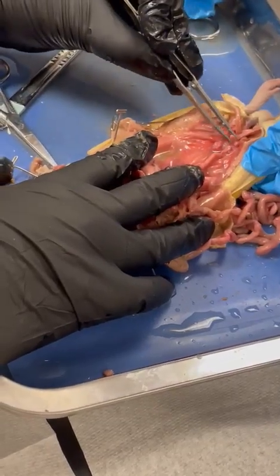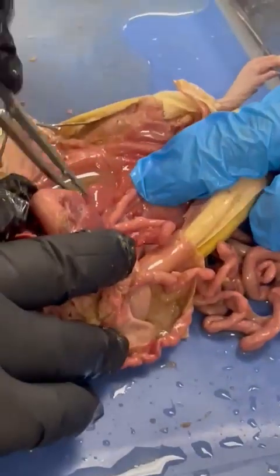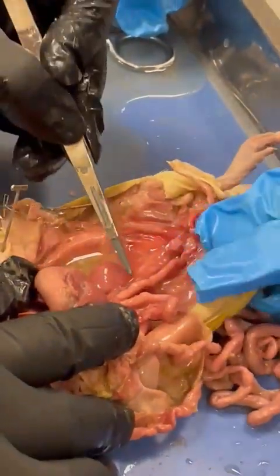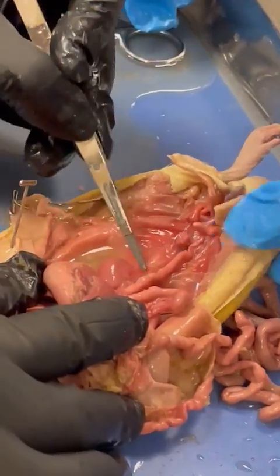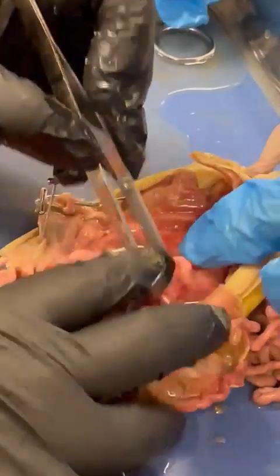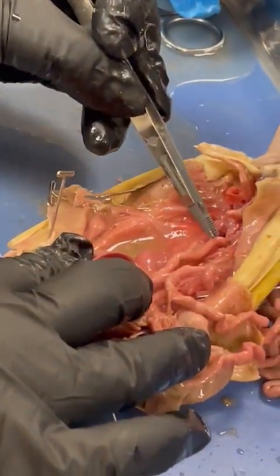This is the urinary bladder. That's a kidney. The adrenal is on top. That small thing is the adrenal. There's the ureter, a thin one, that goes to the urinary bladder. That's the descending colon.